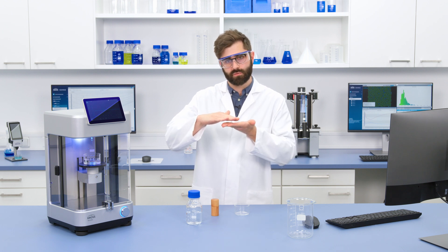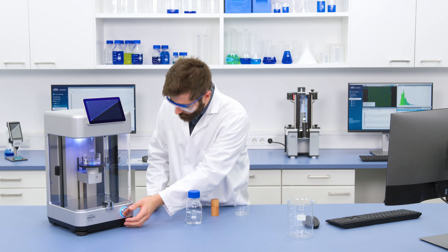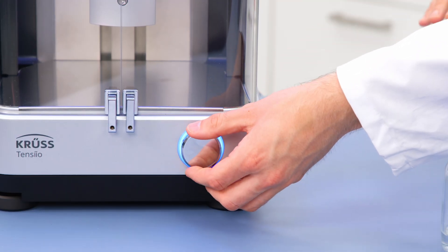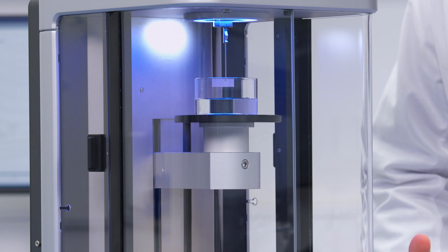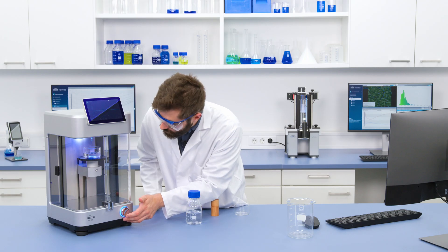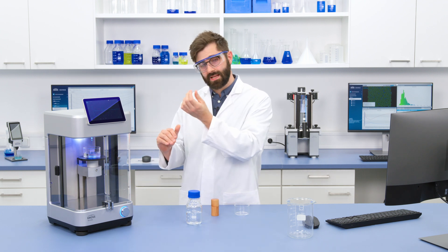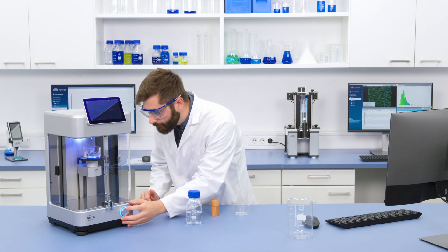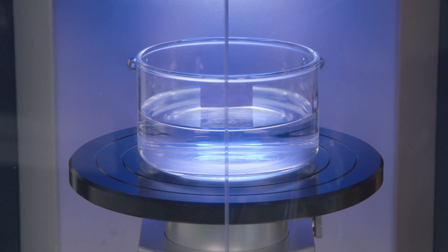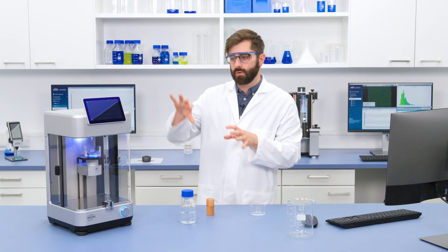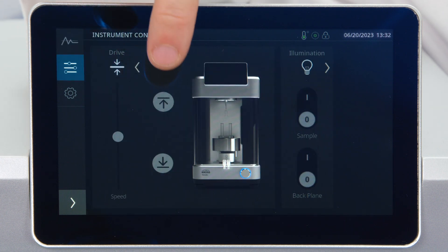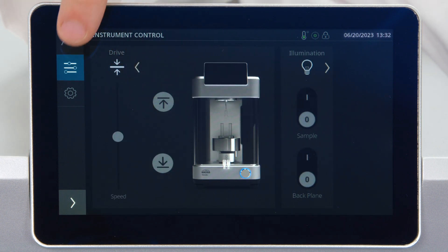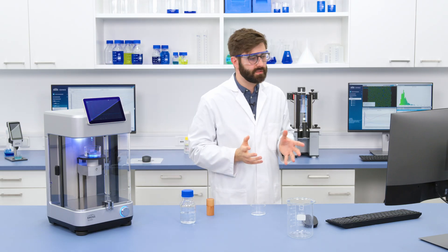The next step is to move the sample liquid very close to the probe. I use the button at the front of Tensio, and pressing in and turning the control lets me move a bit faster. I bring it up until the two are very close together — you can use the reflection of the plate on the water's surface to see how close you are. I make some fine adjustments and save this position in the settings on the touch panel so I can quickly reach it again in the future. Then I go back into ADVANCE, confirm the doors are closed, and press OK to begin.